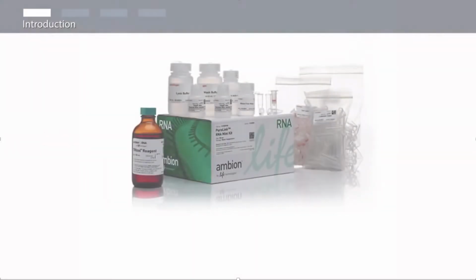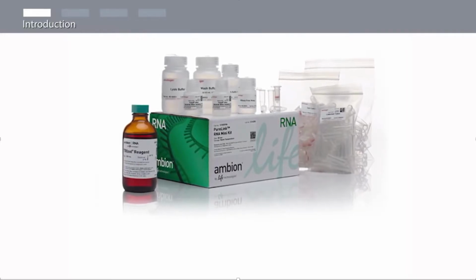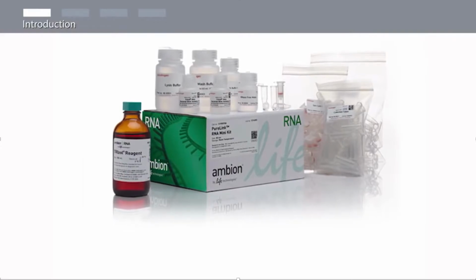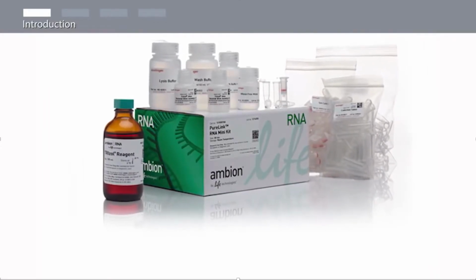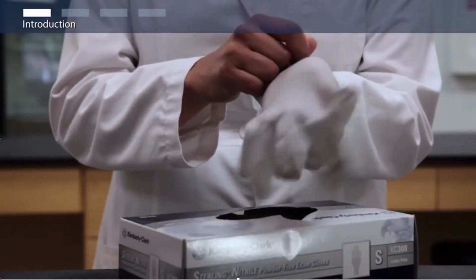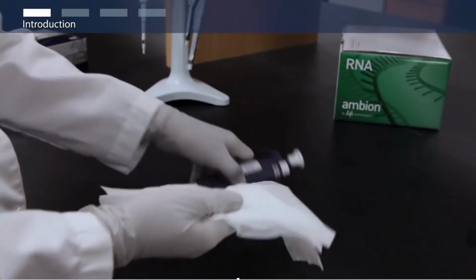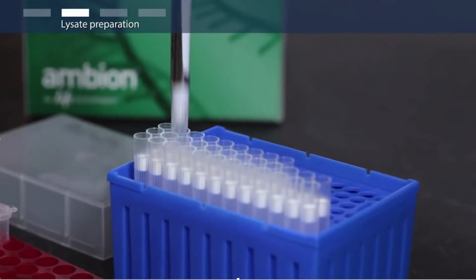The Trizol Plus RNA Purification Kit is based on Trizol reagent lysis technology and PureLink silica membrane purification technology. This combination provides highly pure RNA even from difficult samples like fibrous tissue. For your protection, always wear a lab coat, gloves, and safety glasses. Prepare your work area and wash buffer, and gather your materials prior to starting the procedure. To get started, prepare your lysate.